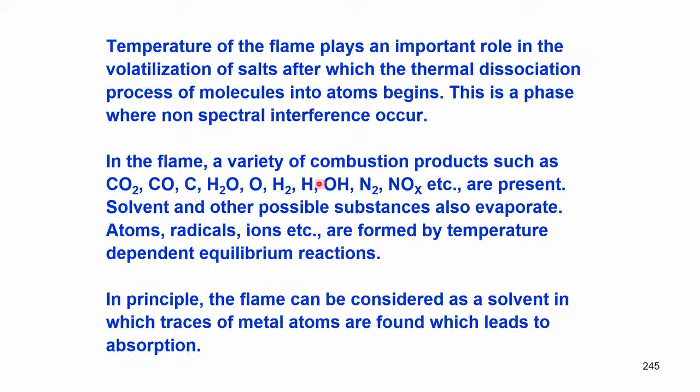So, even though their lifetime could be short, you will see all kinds of spectral evidence in the flame that such compounds are being formed. They need not be stoichiometrically correct, but still they are present for a very short time, of course.